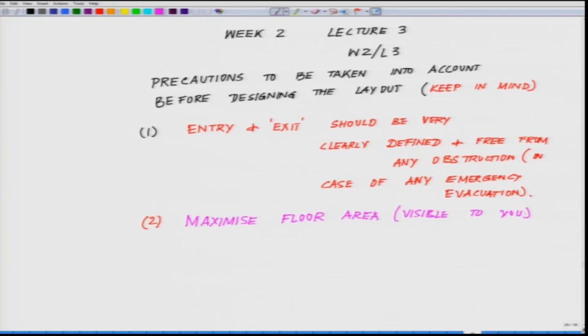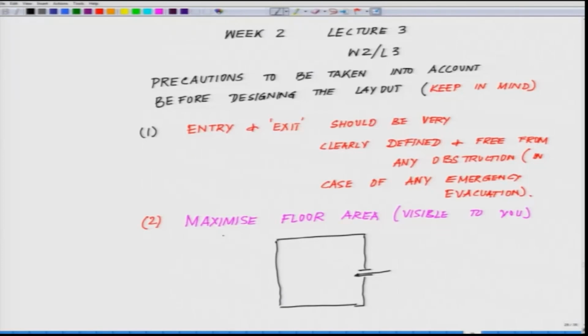Say, for example, you have a facility. Say you have a room. Let me put it down, that will make sense of what I meant by this. Say you have a room like this, fine. So, for example, this is your entry and a common exit. Now, you have options for how you put the benches to work. For the working bench, over the years what I have realized, and what always made sense for keeping the first point in mind, this point 1, and linking it to point 2, is that you should utilize this part.